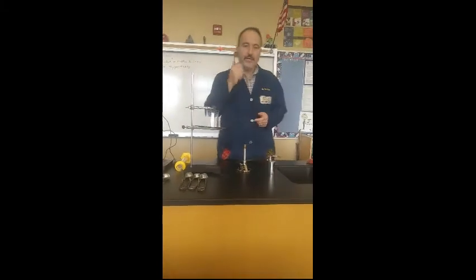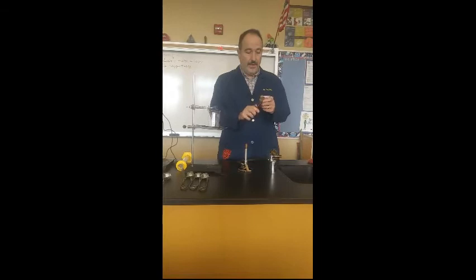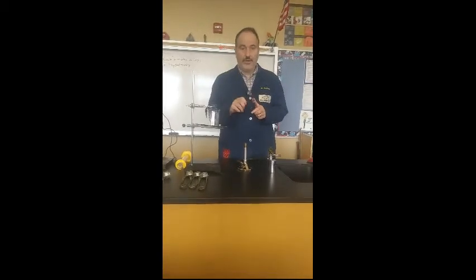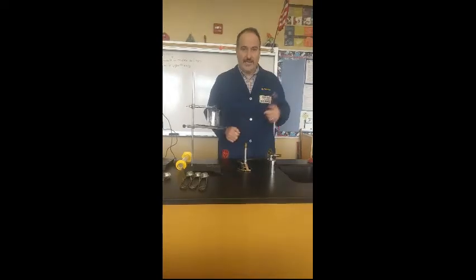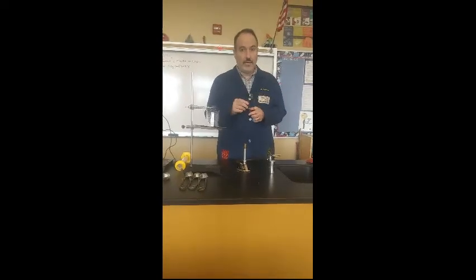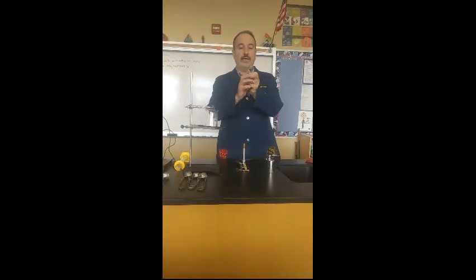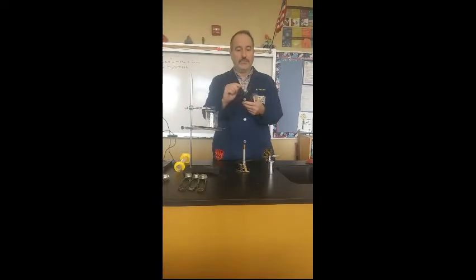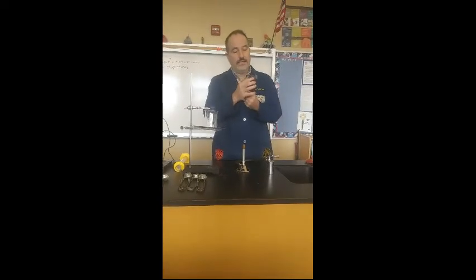Next, you want to make sure that your sparker is working. Now this right here is literally the oldest technology on the face of the planet, okay? This is basically how Neanderthals made fire, by hitting two rocks together. That only works if one of the rocks is flint. And that's what we got right here, a little piece of flint. It's actually artificial flint, but it's still flint right here. And when you take that flint and you strike it against something harder, in this case, a little metal file on the inside, it will make a spark, all right?